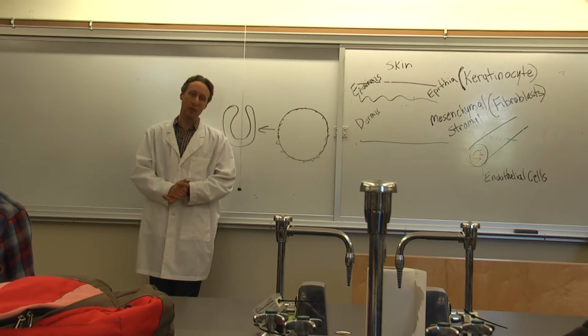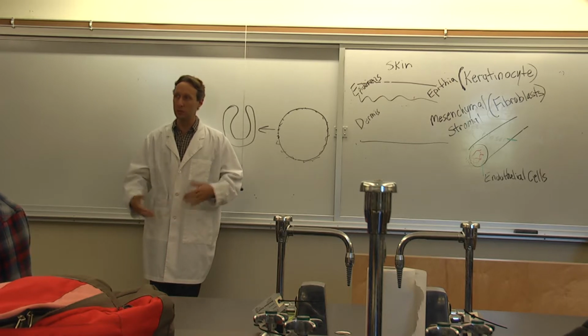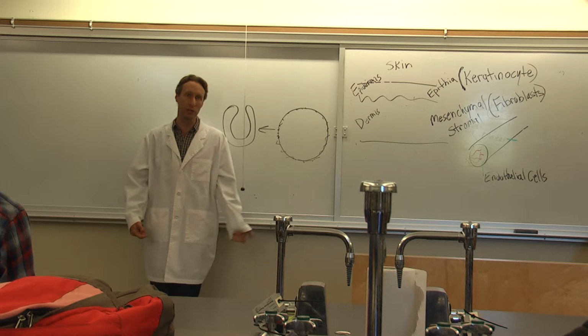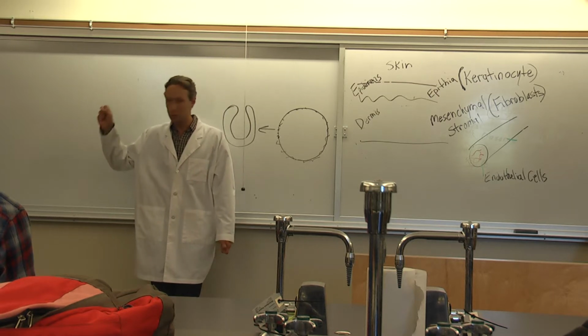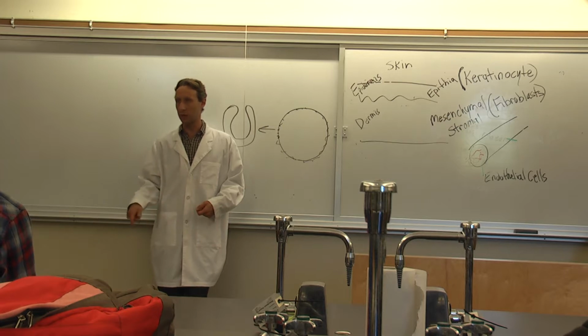Just to emphasize, when something goes wrong in lab, it goes wrong really fast. That's why you need to definitely be prepared ahead of time. That's why you should already be wearing your lab coat or your goggles if you think something's going to be dangerous. Don't reach into the sharp pins, things like that. If you dropped something, you need to be a little more careful that way.